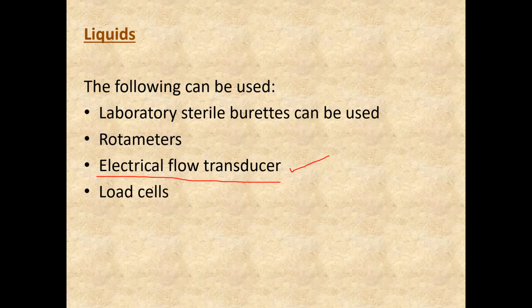The fermenter and all the ancillary reservoirs, all the vessels and pipelines are attached to load cells. These load cells will monitor the increase and decrease in the weight of the various vessels and pipelines at regular time intervals.